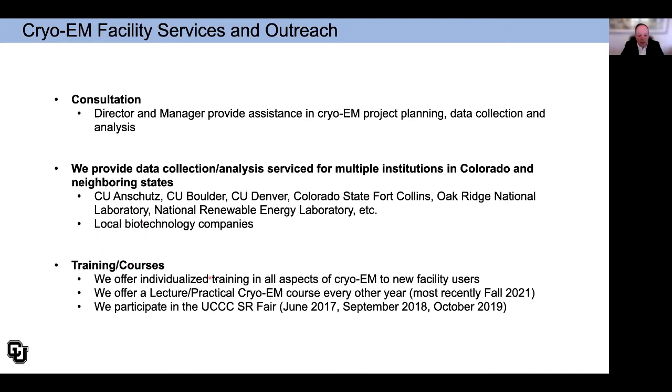And we also have a robust outreach and training program. We offer individualized training in all aspects of CryoEM to new facility users. I also offer a lecture class on CryoEM every other year as part of the structural biology program on campus. And that class is a combination of lectures and practical hands-on experiences in CryoEM. And we also participate regularly in the Shared Resources Fair organized by the Cancer Center.